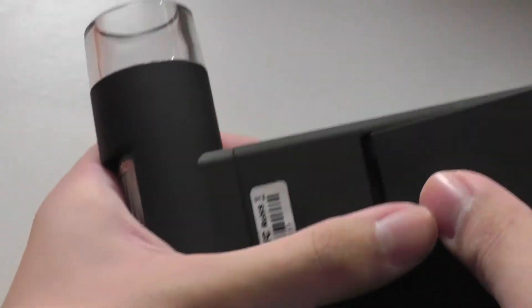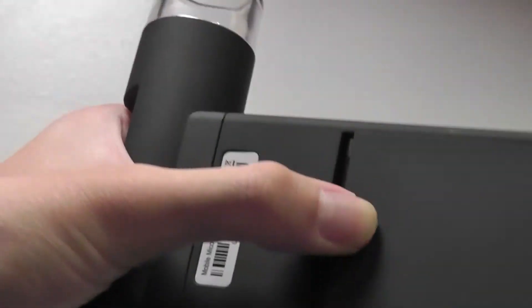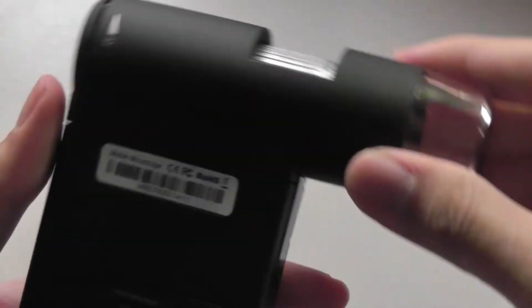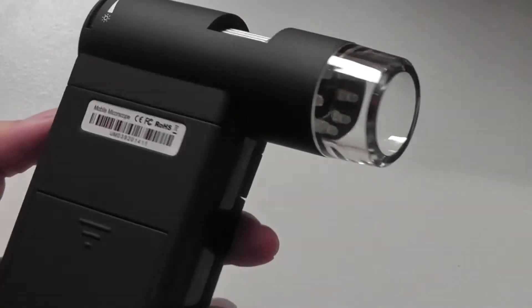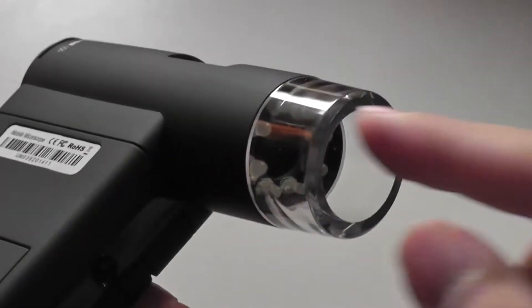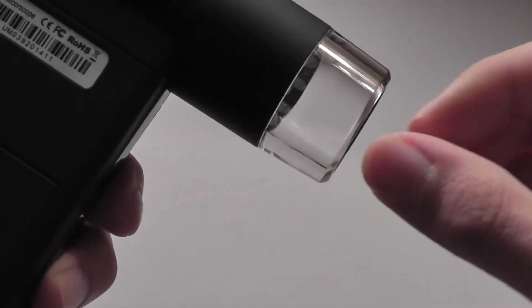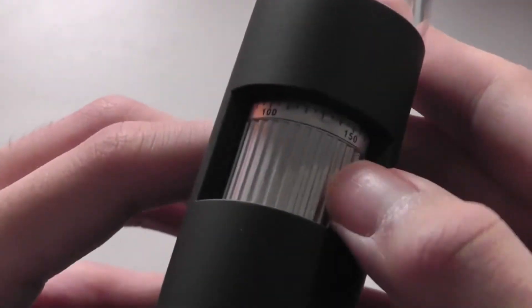Taking a look at the other design elements, we can see that it has a rather large lens protruding on the sides for getting up close with subjects. It's recommended that you don't place anything on the inside of the microscope, but just leave it on the outside without actually having something stick in. You focus everything by the top.